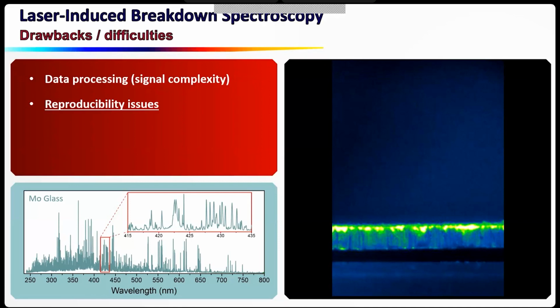And I wanted, with this video, to show you the evolution of the plasma while the laser is firing at the same position. So here you have an aluminum plate of 1 millimeter and some air here. And then this is a polymer. And the laser will fire from the top to the bottom. Let's go.